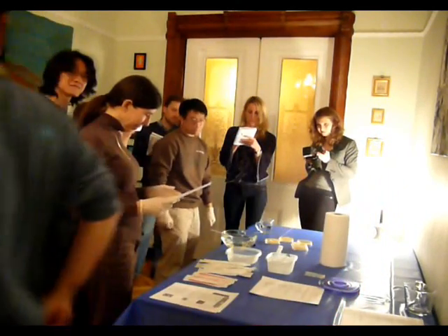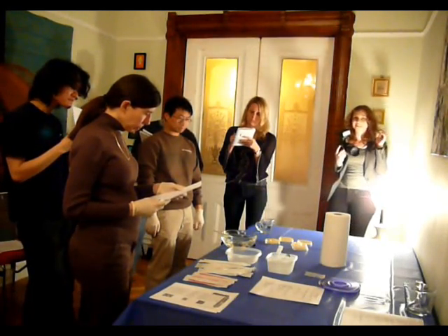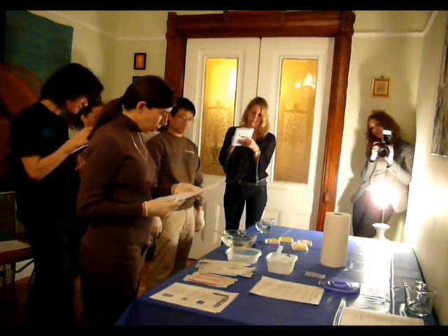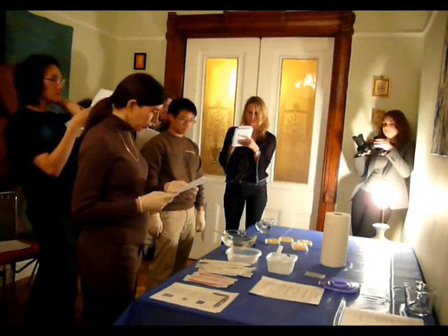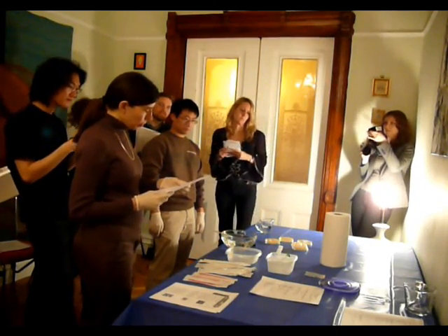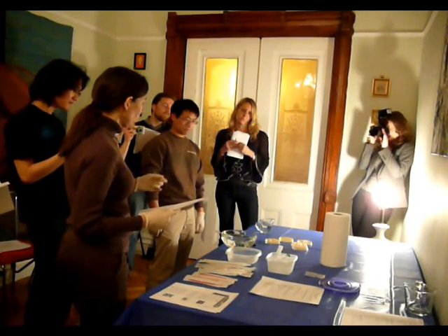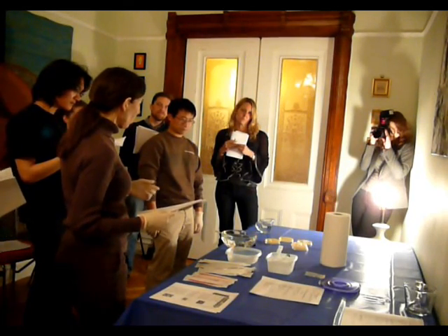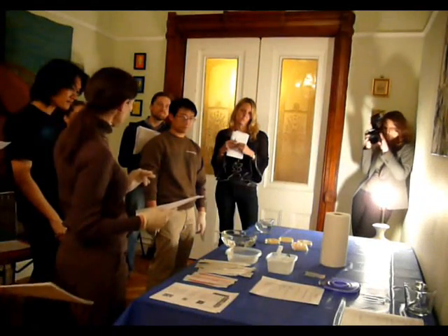So if you look at the procedure: place both tubes on ice. We placed them on ice. Use a sterile plastic inoculating loop to transfer isolated colonies of the E. coli from the starter plate to the plus plasmid tube. The total area of the colonies picked should be equal to the top of a pencil eraser. Be careful not to transfer any agar — the reason why you don't want to transfer agar is because some components of the agar inhibit the transformation reaction.